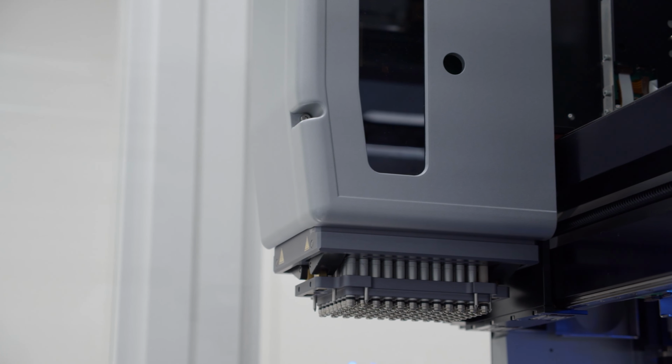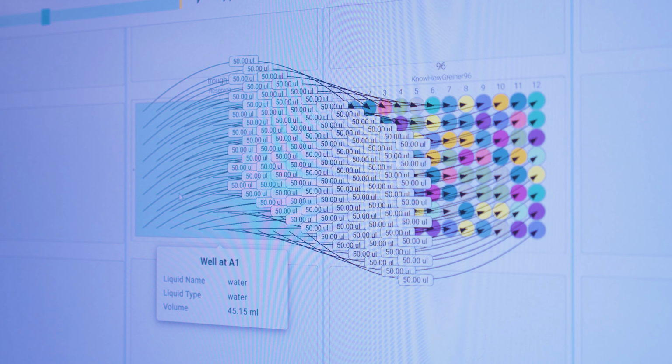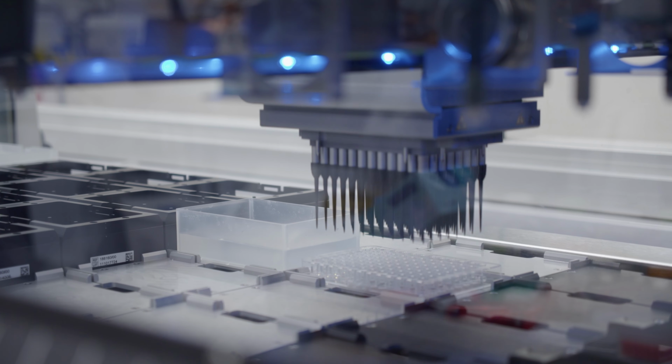If you have a 96 head and have specified a workflow step in which you transfer one volume of liquid from a reservoir into a 96 well plate, the 96 well head will kick into action.